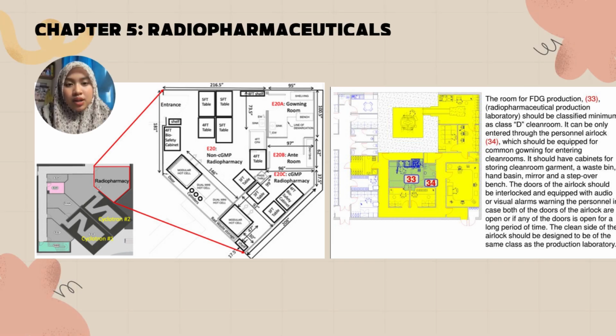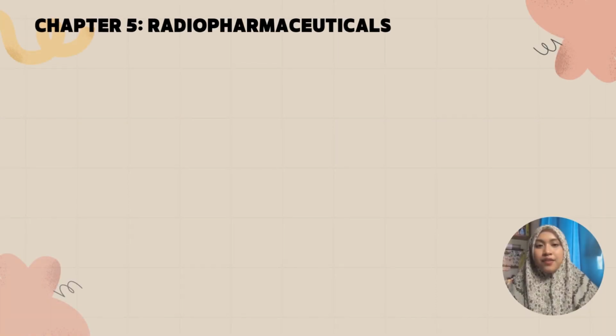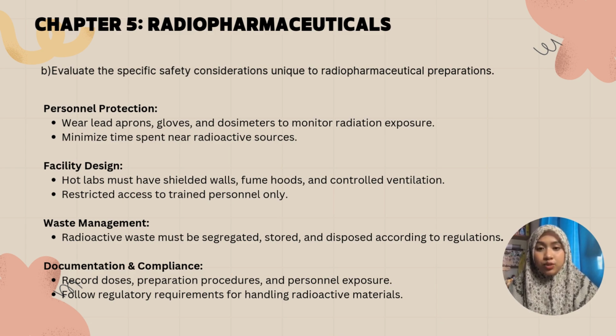In this slide, it shows the diagram of the radiopharmacy facility layout, including the radiochemistry laboratory, clean room system, and so on. So next, radiopharmaceutical preparation requires patient safety precautions because they involve exposure to radiation.